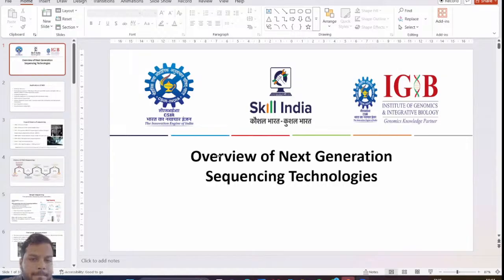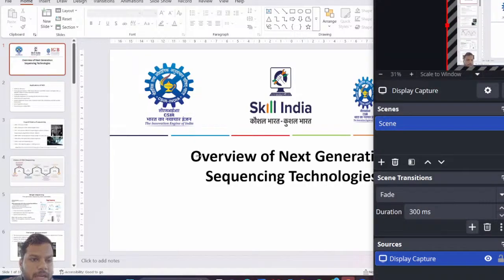Sir, I have a question. Yesterday we were studying base pairs, and they were assigned some quality values, and they were named like I, J, and H. Sir, can you please explain the quality values of I, J, and H? I, J, and H. Okay.